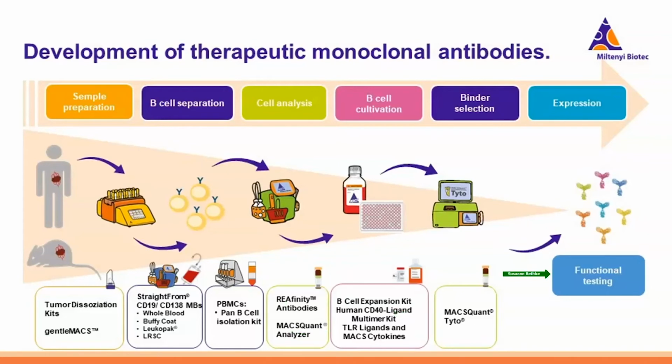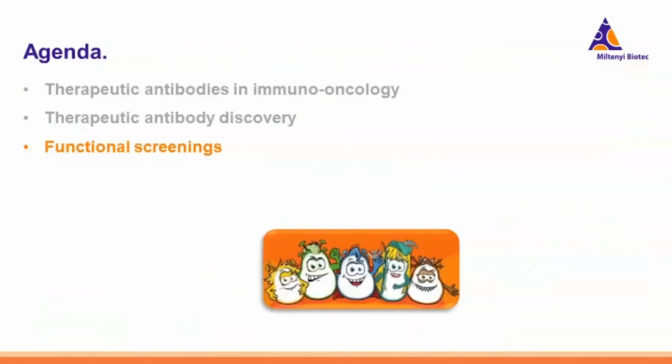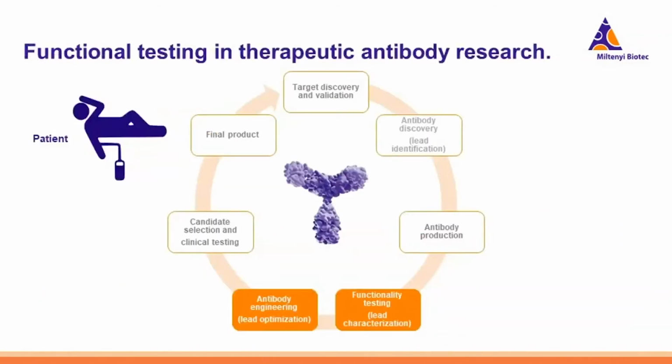So now we have our lead candidates. Okay. So now we want to know what they are actually doing. So now functional testing is happening for this lead characterization, but also for the optimization because you really want to make them work better.